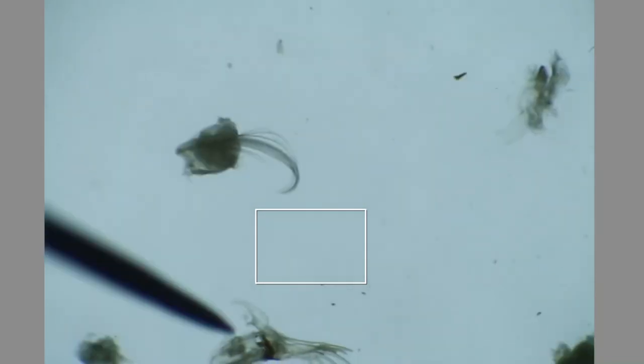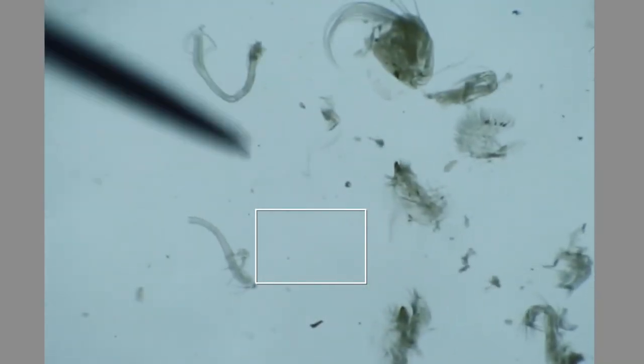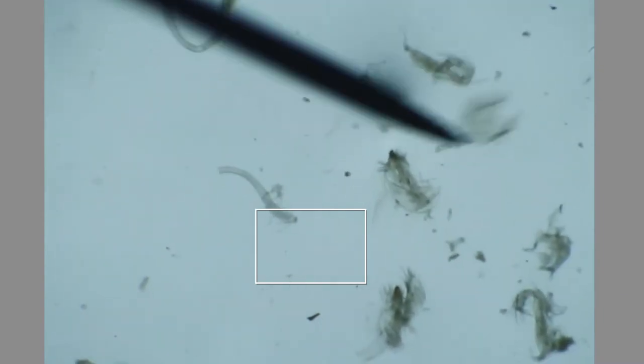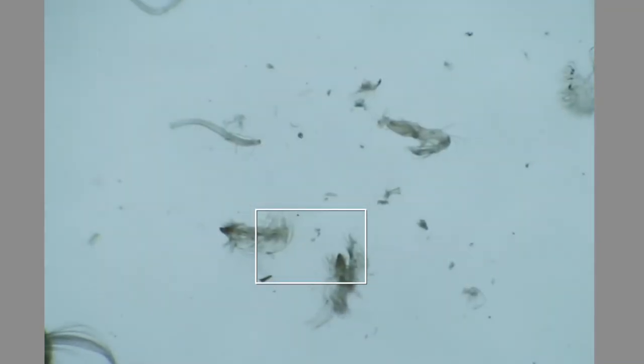That's the edge of my drop of glycerol. I want everything a little bit inside from the edge, but not on top of each other. Because when I press on the cover slip, things are going to move outwards, and I don't want all of my limbs to be on top of each other — they'll be really hard to photograph and really hard to measure.